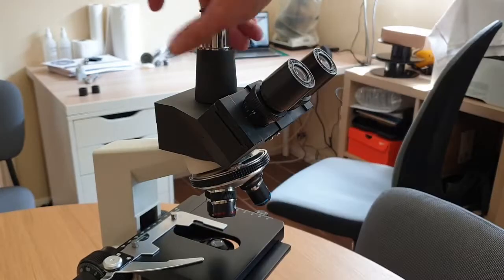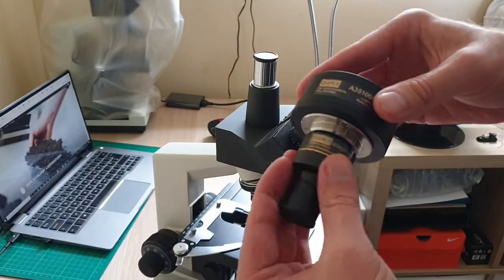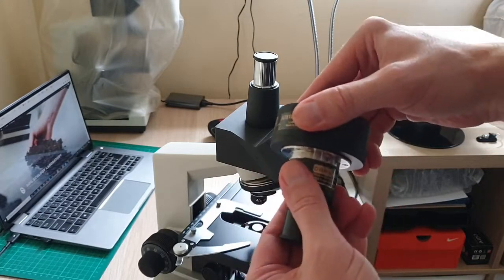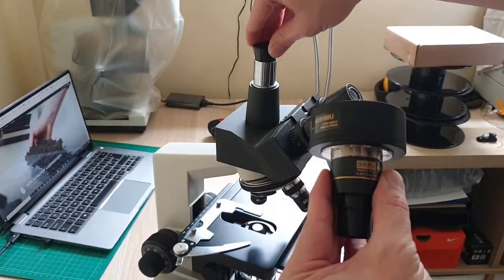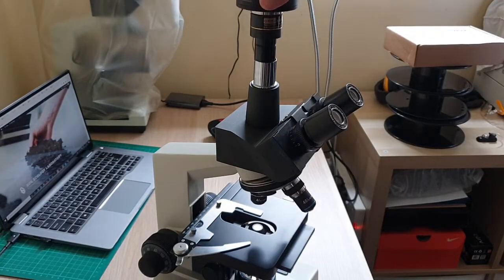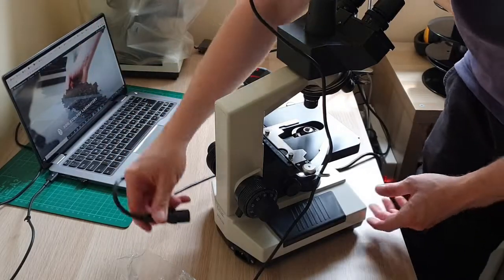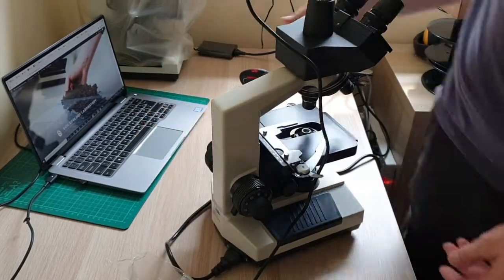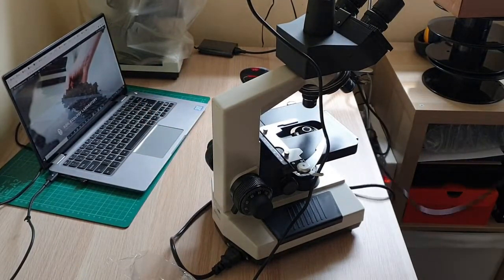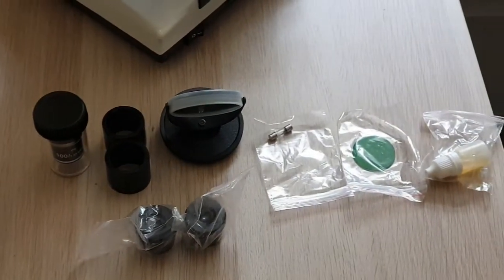After that we install the camera tube which screws in from the top. Lastly it's time for the camera itself — it comes in two parts: the camera body and the c-mount. They screw together and slot into the tube just like the oculars. Connect the USB cable to the camera, plug in the power lead and press the light switch on the side. Keep these spares safe if you ever choose to use them. You now have a fully working microscope.